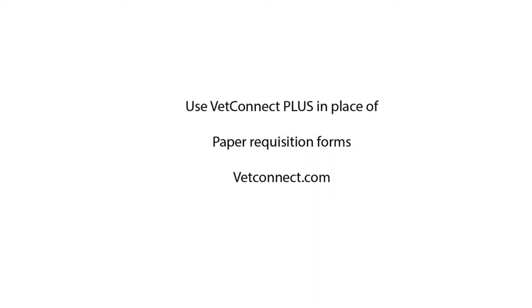Remember, if you currently order tests through your practice management software, continue to do so. Switch to VetConnect Plus only if you currently use paper forms or if you use VetConnect.com.